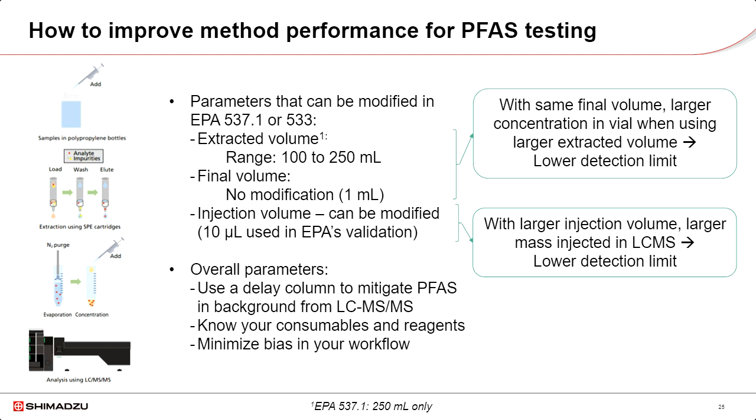What I mean by that is that you need to test them to check for PFAS in the background, but you also need to understand the impact the quality of the reagents can have on the signal in the LC-MS. And of course, minimize the bias in your workflow.